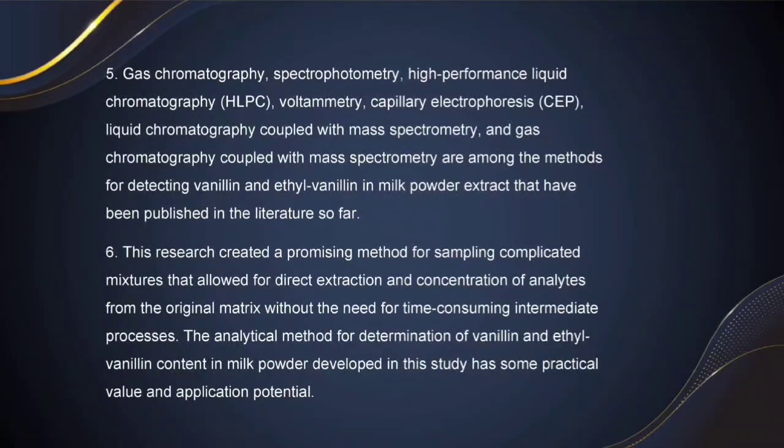Gas chromatography, spectrophotometry, high-performance liquid chromatography, voltammetry, capillary electrophoresis, liquid chromatography coupled with mass spectrometry and gas chromatography coupled with mass spectrometry are among the methods for detecting vanillin and ethyl vanillin in milk powder extract that have been published in the literature so far.